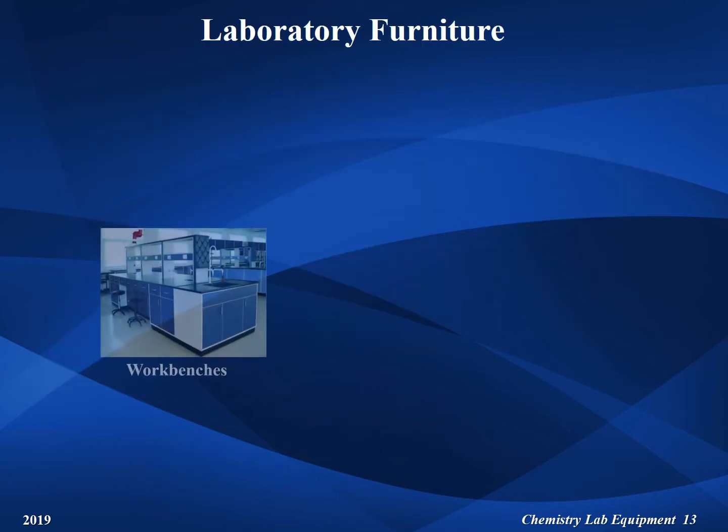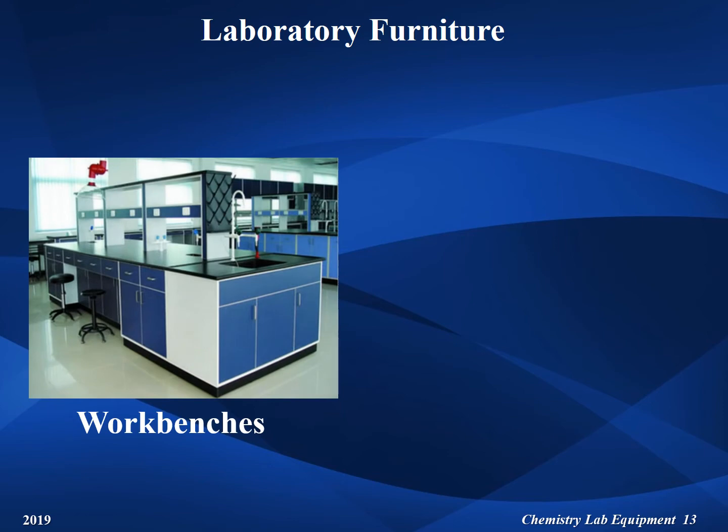This photo shows some of the basic furniture used in a modern laboratory. The workbenches typically have a source of running water, and a large sink as well as valves for natural gas, running cold water, and sometimes vacuum from a central source.